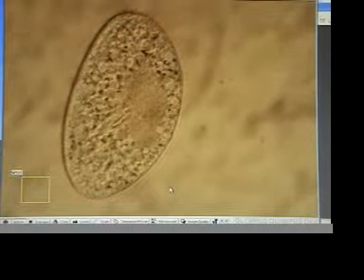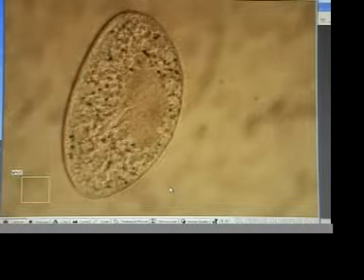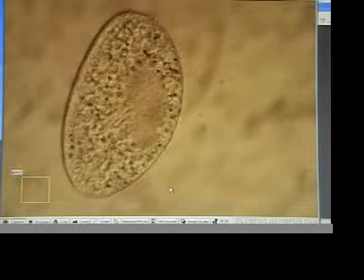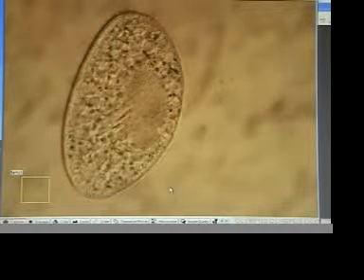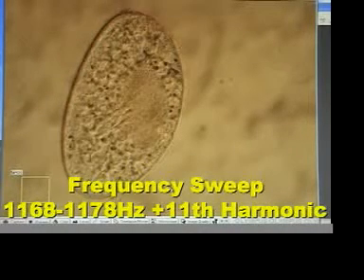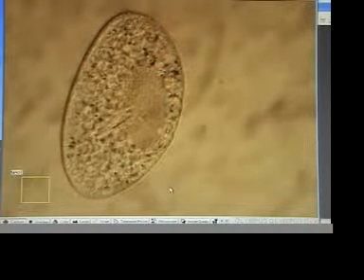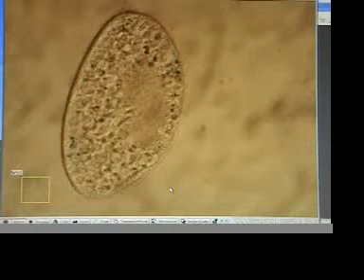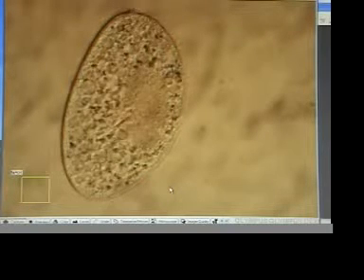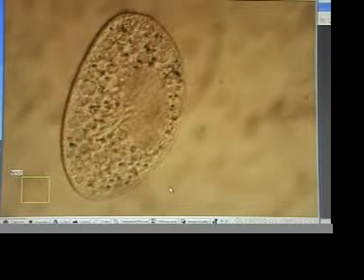He's gone through a series of three minute exposures starting at 1168, running up to 1177. We're now at 1177 plus the 11th harmonic. We're going to keep an eye on this guy and see what changes happen. We're looking at this paramecium from below using an inverted microscope. You can see there's a lot of celia action going on.